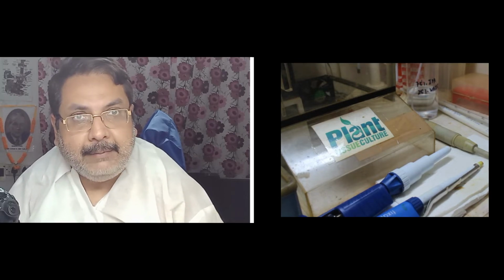This is a 1 ml variable auto pipette. This is a 100 to 1000 micro ml auto pipette. 1000 micro ml means 1 ml. 1000 microliter means 1 milliliter.